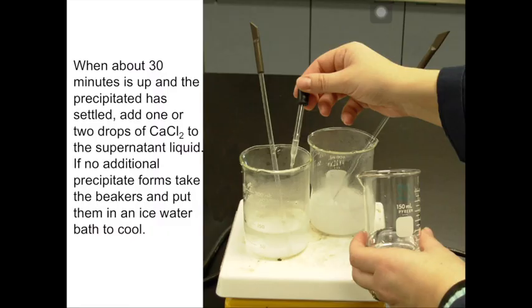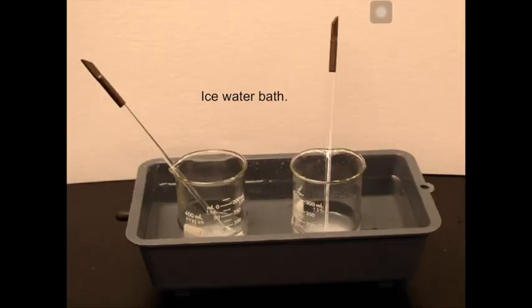The experimenter waited until the precipitates settled and added a few more drops of precipitating agent to check whether or not the reaction has been completed, or whether or not all the analytes have been precipitated already. If the analytes have been precipitated already, there is no more formation of precipitate upon addition of precipitating agent. But if you add precipitating agent and notice some formation of cloudy precipitates, it means that the reaction has not completed yet. For this experiment, they used an ice water bath to aid the precipitation.